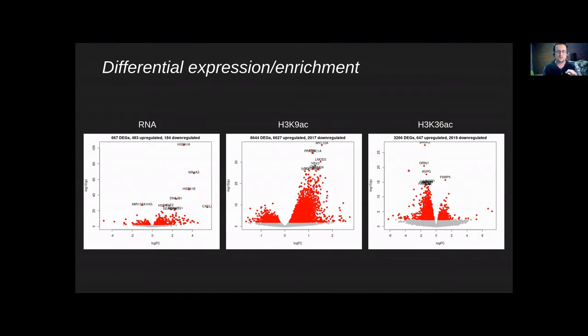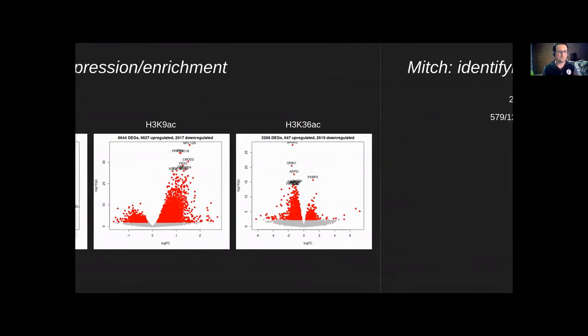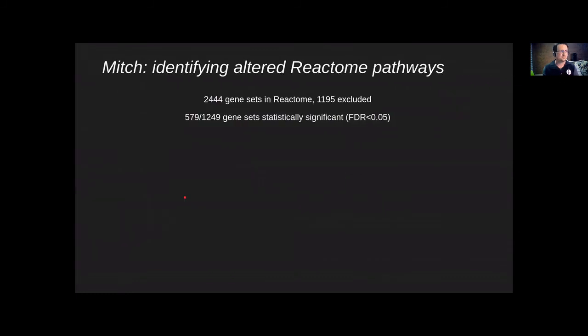So what this kind of suggests is that there's really large-scale changes to the acetylation of the histones, but these are yet to appear manifestly in RNA levels after just 1 hour of exercise.